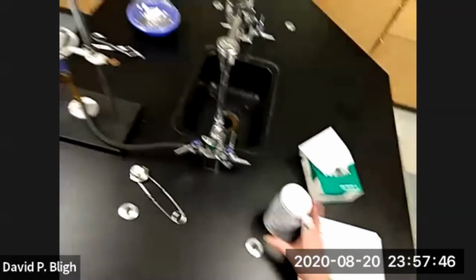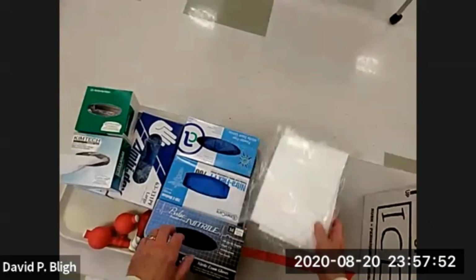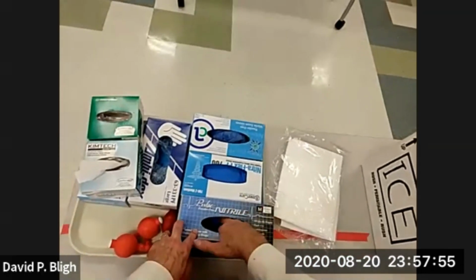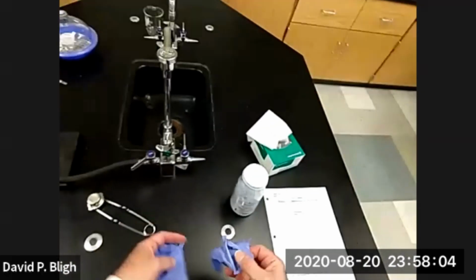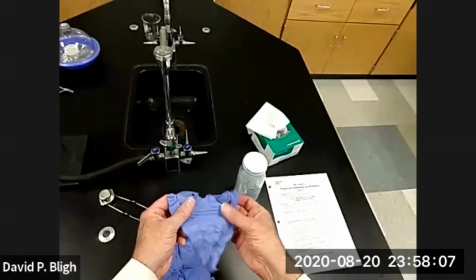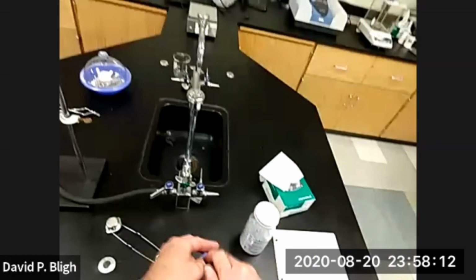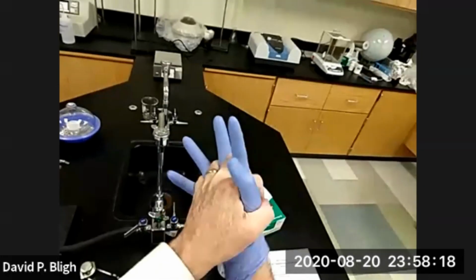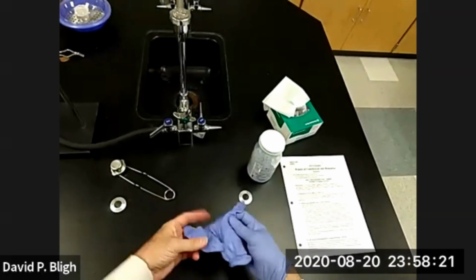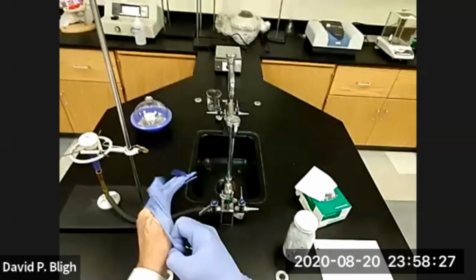Now, while we're waiting, suppose we were going to use gloves. How would you use gloves? These are the last ones there. Okay. These are nitrile gloves. We use nitrile because latex sparks allergies in some people. So these are nitrile gloves. And everybody knows how to put a glove on, probably. Just get it on your hand like that and bring it down. Now there's a pair. Here's one right there.